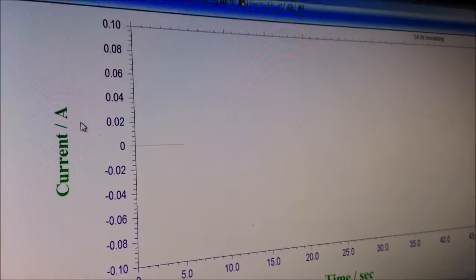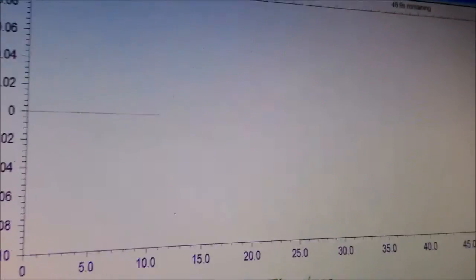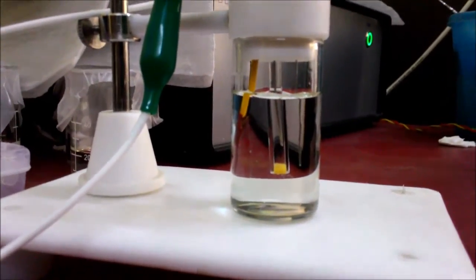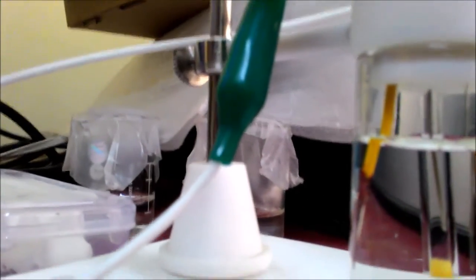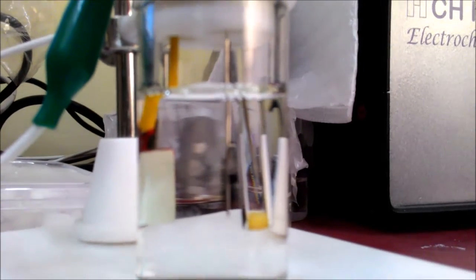You can see the IT curve is going on and electro-deposition is happening. Depending upon the electrolyte, you can find some bubbles coming out of the electrode. You cannot see substantial bubble movement here, however it is happening — lithium deposition is occurring on the electrode.